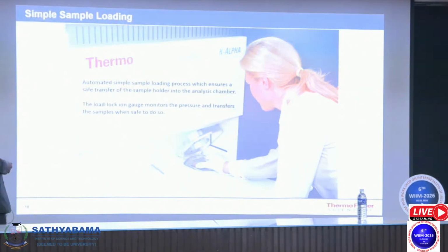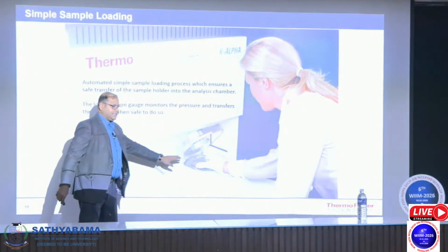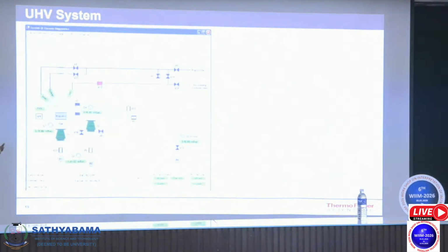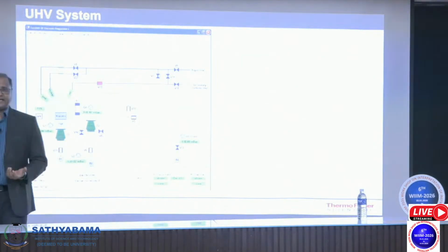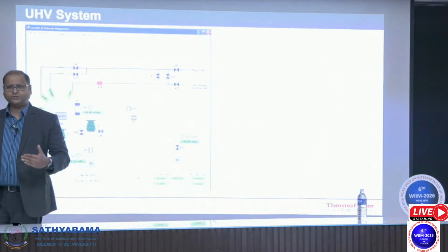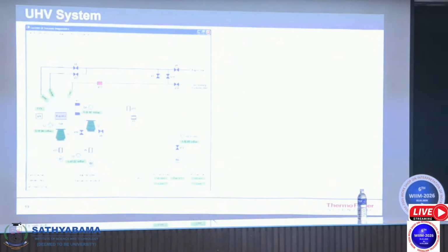All those nightmares have been taken care of, and it is as easy as loading the sample, which is shown in this slide. And whenever we talk about an XPS, I mentioned that it works at ultra high vacuum. So when you go for measurement, as a user, you should have the discipline and the practice to take samples which have no moisture or water content. It is also your responsibility to ensure your samples do not degas the moment you put them under a vacuum. So these two precautions, as a user, you should take.